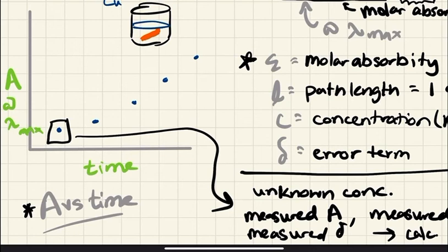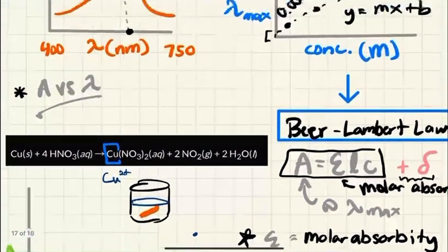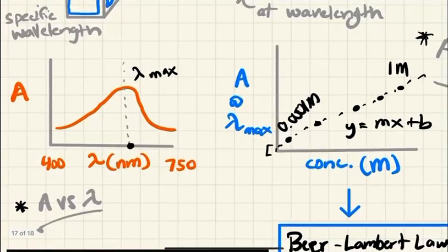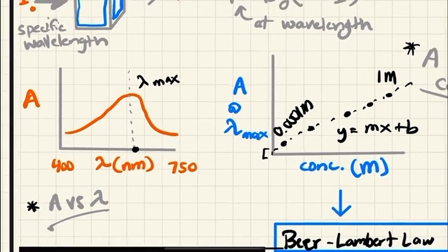You'll learn how to do this using an app that connects by Bluetooth to the spectrometers, but there are alternatives if that is not going to work appropriately for you. But just go and check the guidelines on how to use whichever technology you select in the Guide to Collecting Digital Data in the Chemistry Lab document.